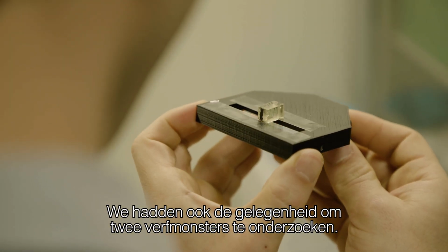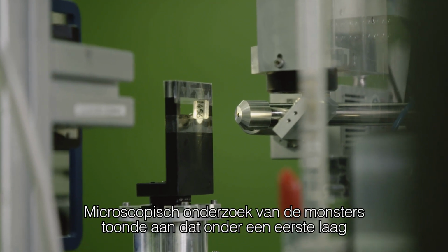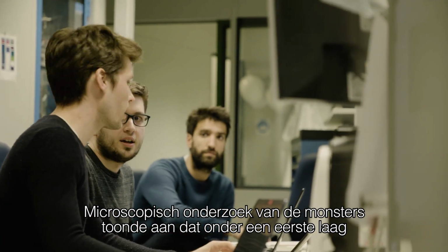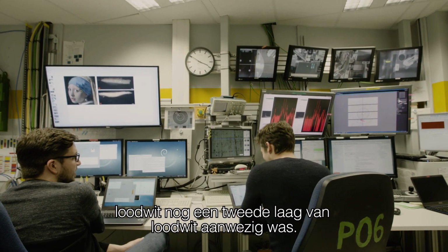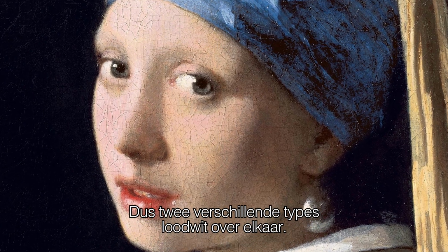We were also able to analyze 2 very small paint samples, and we could analyze these on a microscopic level, and there we indeed saw that underneath a first layer of lead white, a second layer as well was present, so 2 different lead white layers on top of each other.